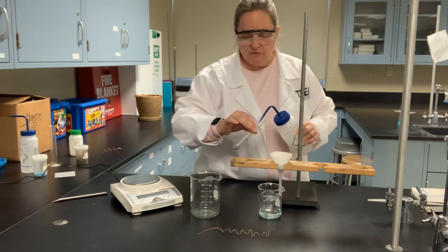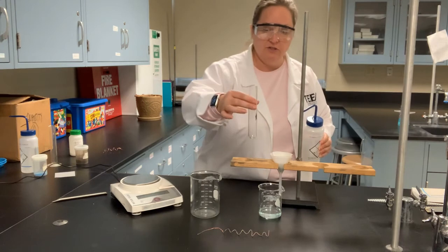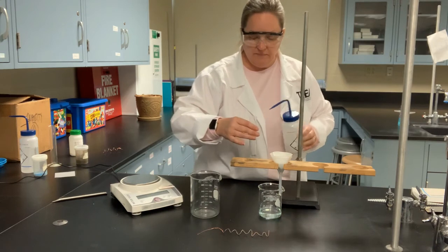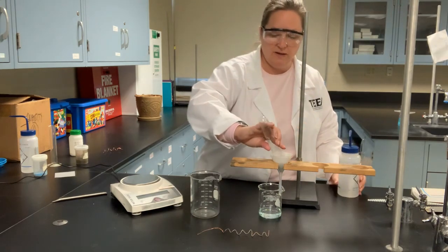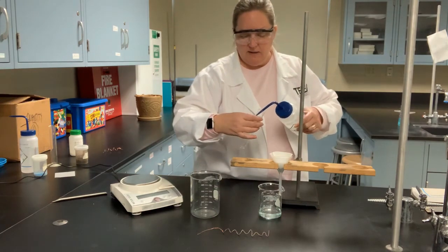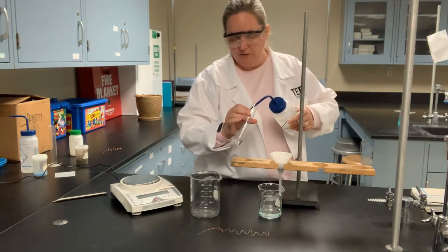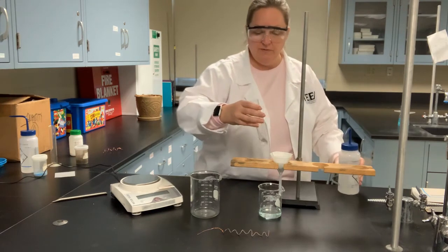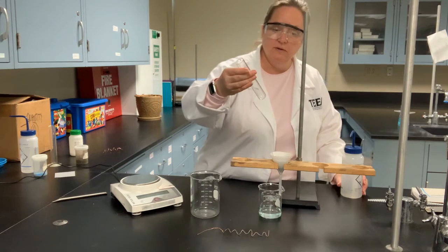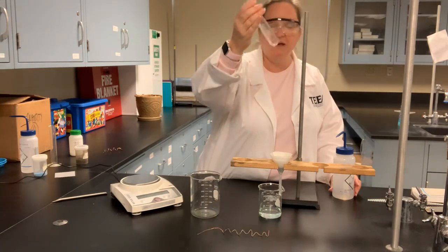So I'm going to use my deionized water bottle, try to get it moving, and there, second shot, I got a good bit of it out. Rinse it down again, good swirl around, all in one shot. I still have a little bit that's left behind, and I'm just going to continue this process, rinsing down the inside of the tube with the deionized water bottle, swirling, and adding to my filter paper. At this point, I think we've got it.